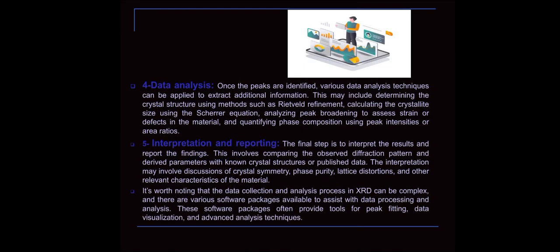Fourth one, data analysis. Once the peaks are identified, various data analysis techniques can be applied to extract additional information.